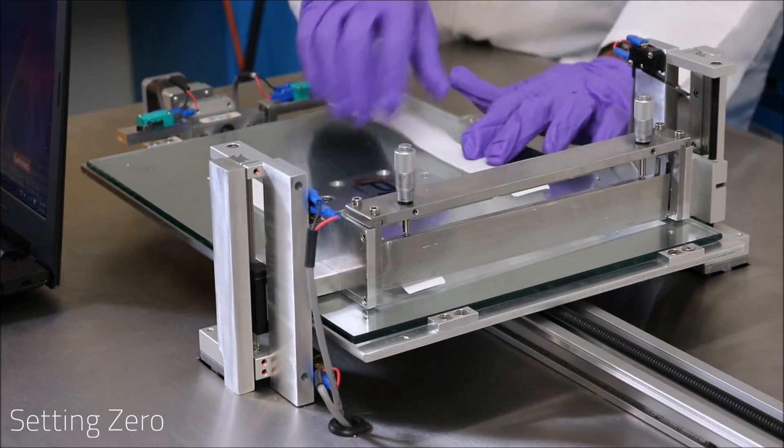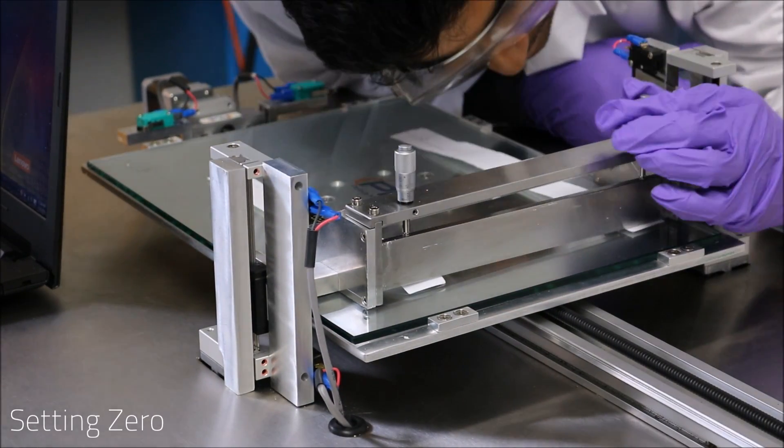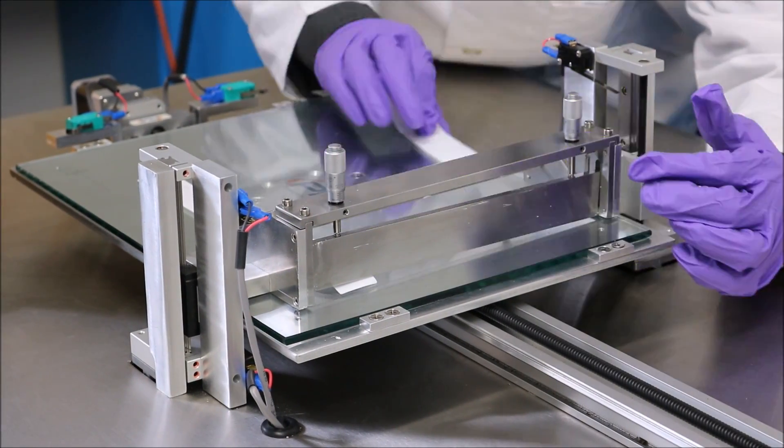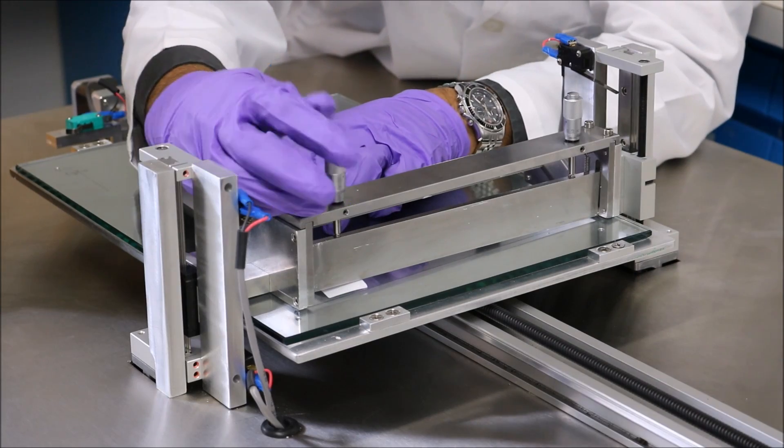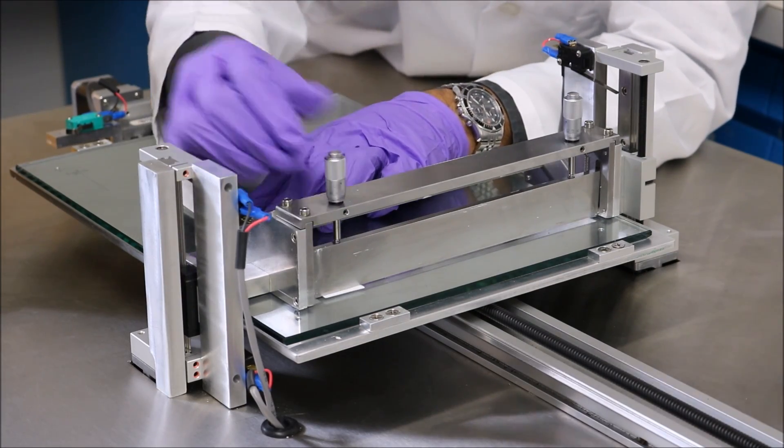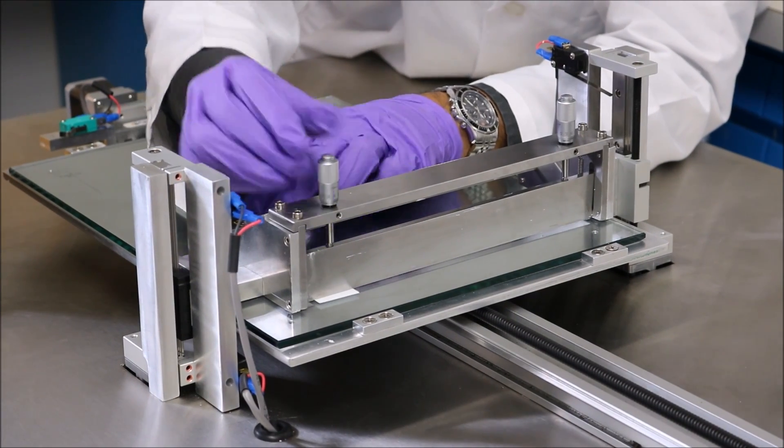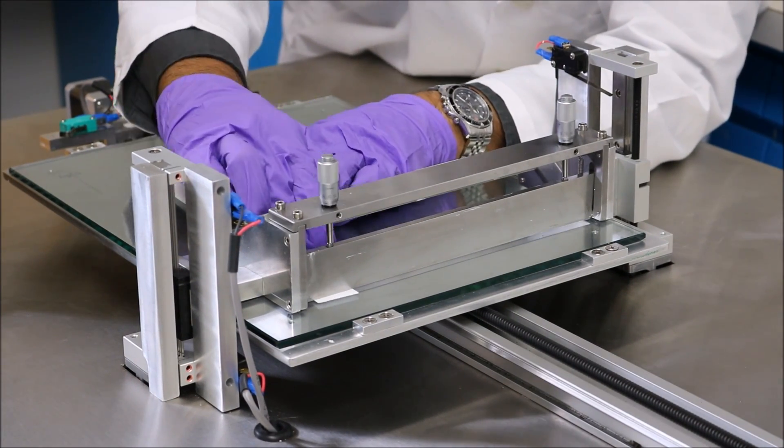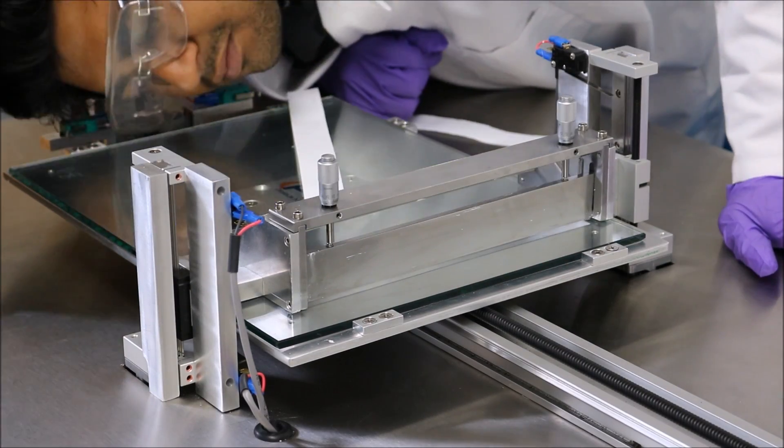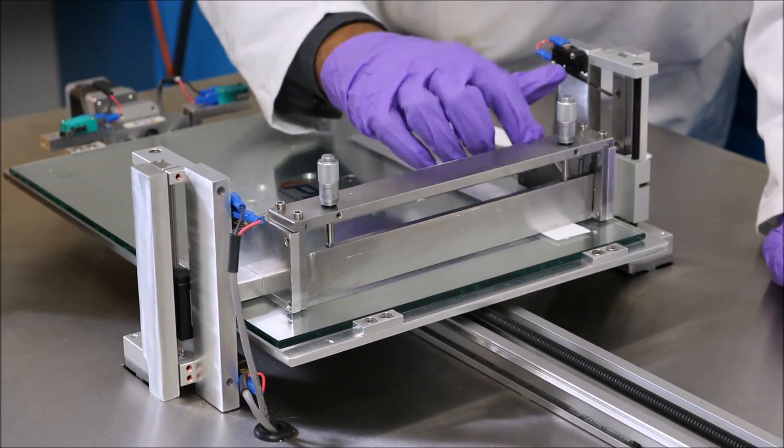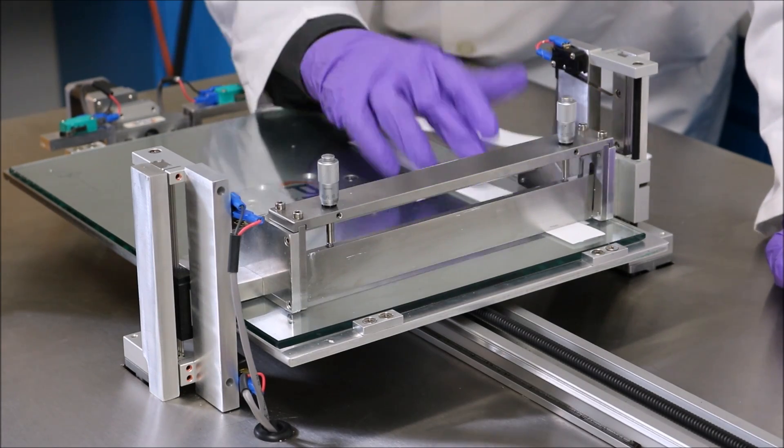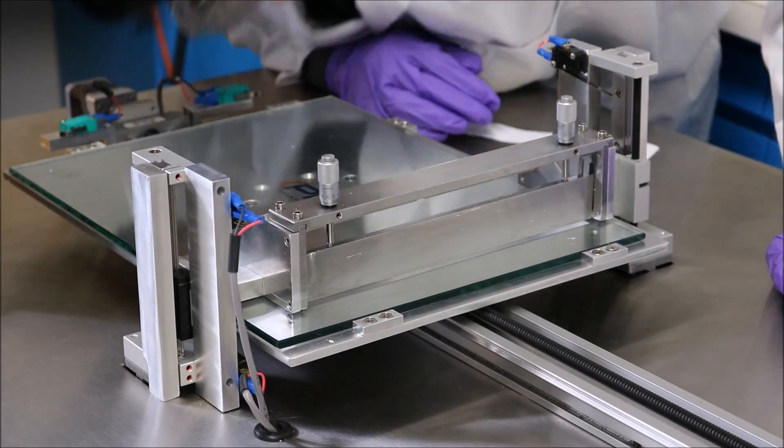Now we will set the zero point for the doctor's blade. This is done in essentially the same fashion as the step before. The only main difference is that instead of using the program to control the actuators up and down, we are now using the more precise micrometer instruments to set the zero point. The goal is the same though. What we are trying to do is to lower it down to a position where the paper is difficult to pull out but is not completely stuck under the doctor's blade.